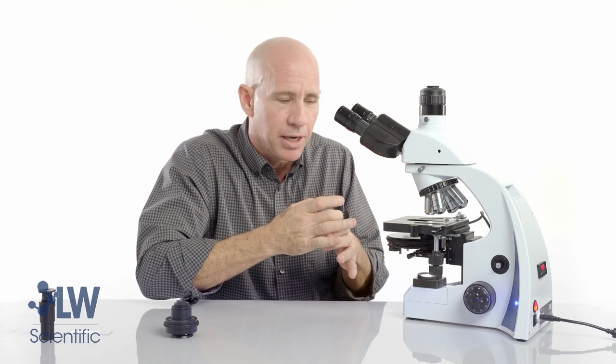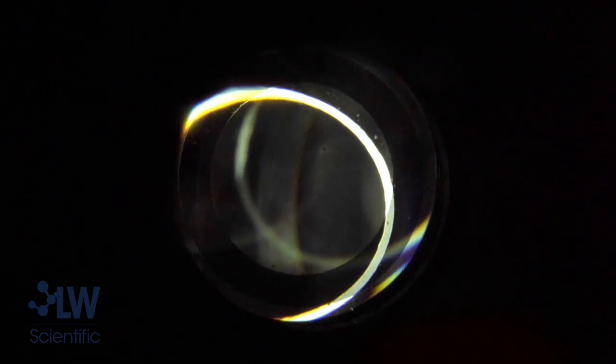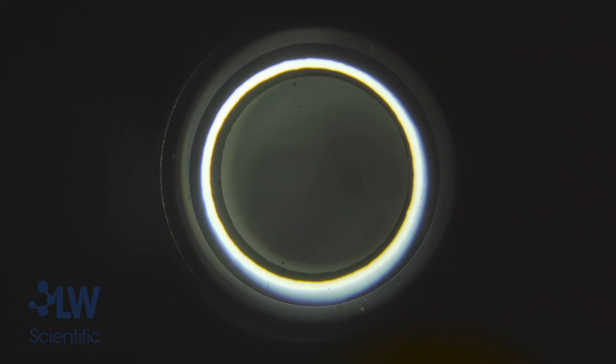If the whole condenser is off to one side, it will be hard to get those annulus rings aligned. In that case, you may have to turn your gross alignment knobs to shift the condenser over and then repeat the alignment process. Hopefully you found this video informative and your microscope is set up properly and performing well. Don't hesitate to reach out to the LW Scientific sales team if you need any further assistance.